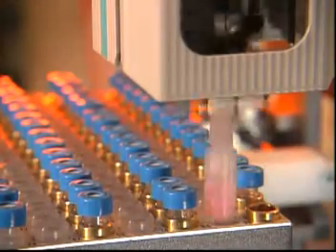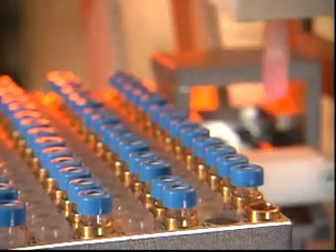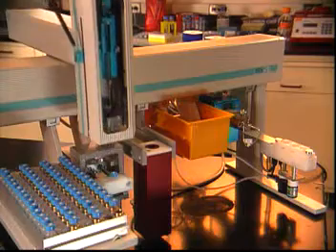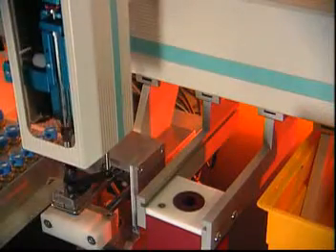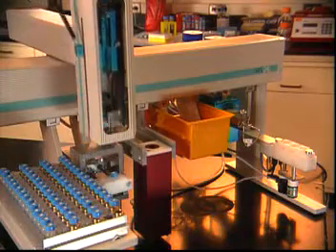Mini-Uniprep is also automation ready for 24-7 high-throughput labs. Thousands of samples can be processed per day, reducing labor costs and improving workflow.